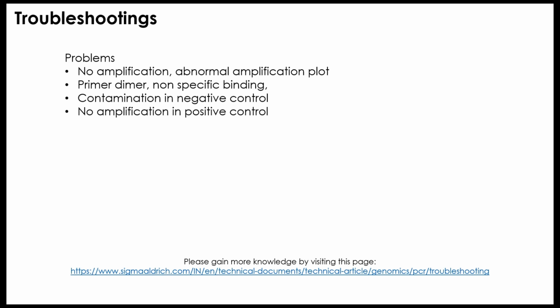For example, if RNA itself is not coming, then it could be that your reagents may not be working, or you are not working properly in the laboratory to get the RNA. Once you get the RNA, you have to do the DNase treatment correctly, which is again very important. Even if you do the DNase treatment properly, you have to run the gel and check that the DNA is still not there.